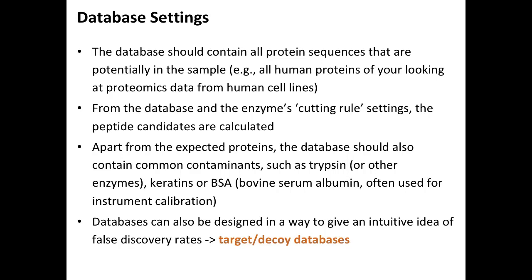It was a pretty smart idea when people started using Target-Decoy databases, because that gives us a very intuitive understanding of this false discovery rate.